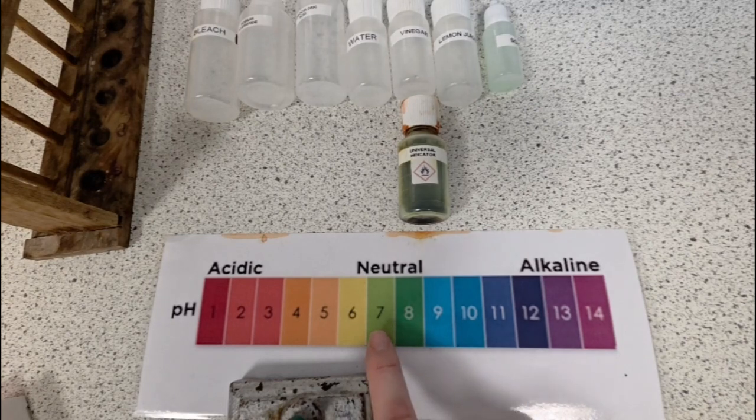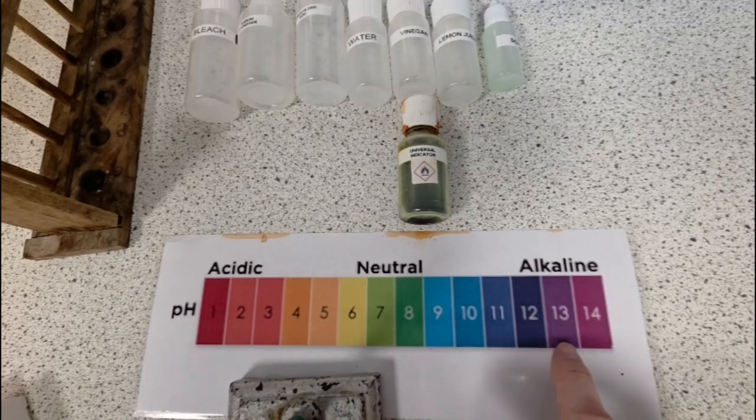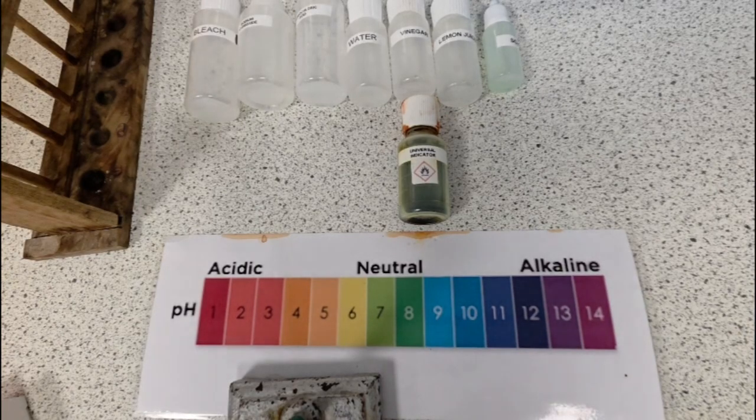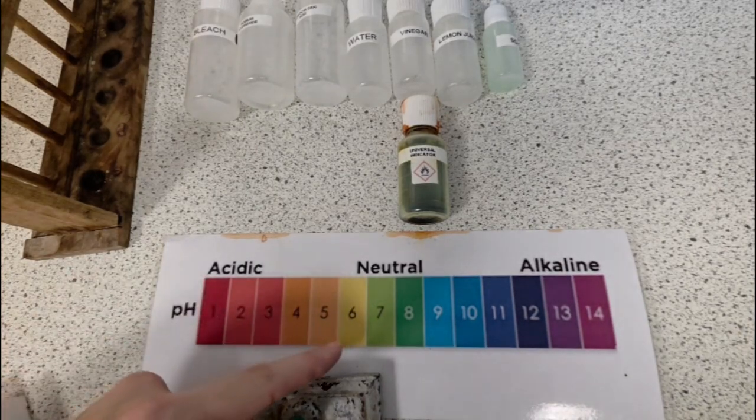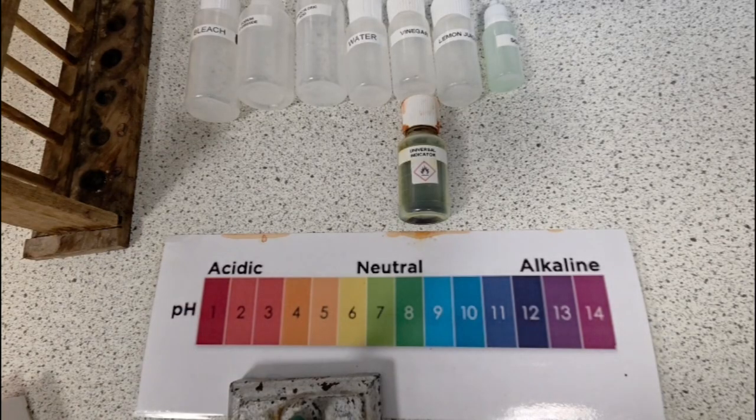Neutral is a nice light green shade, but as you add more and more alkaline substances to it, its color slowly changes from dark green to blue through to purples. Acids, when they're very weak, will be yellow in universal indicator, and they will slowly go through oranges and reds as the acid becomes stronger.